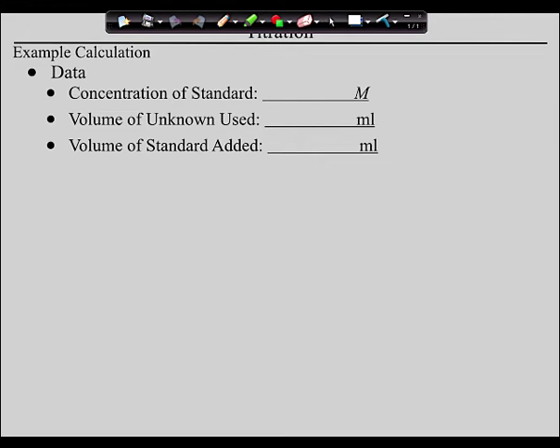This is just water. Then, in order to titrate, what you do is you put the acid underneath the burette with the standard, and you put some indicator in here that changes color at pH 7. Then you open this up and you let the base, the standard, drain into the acid until this changes color, and at that moment you know that you've now neutralized the acid and the titration's over. Now guys, in order for this to happen, it's critical that you stir this, and actually it turns out that a stirring rod is not a good enough way to stir this.